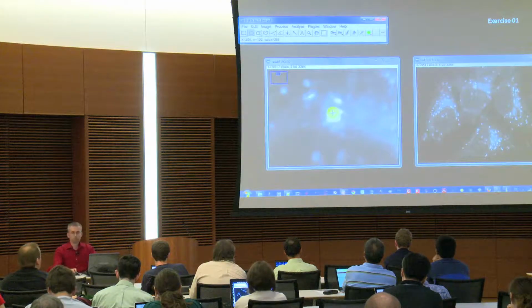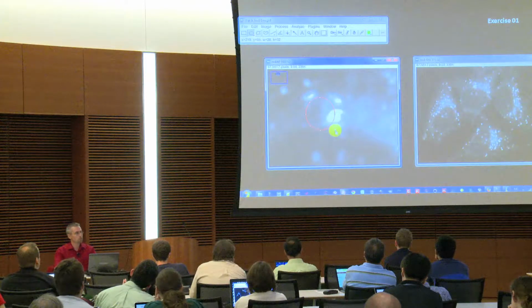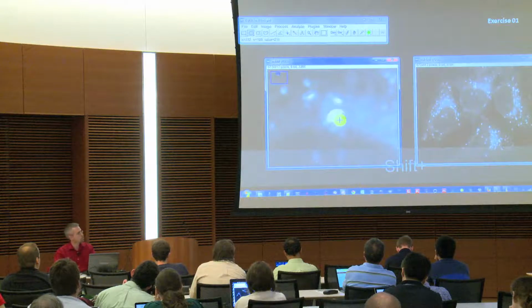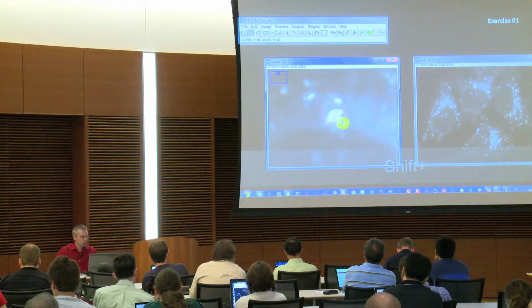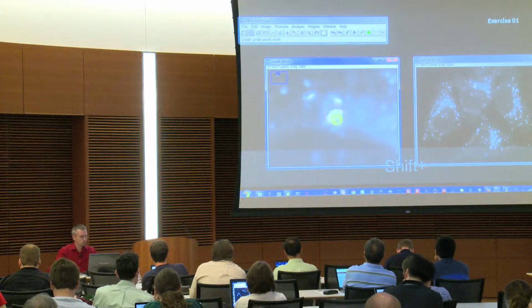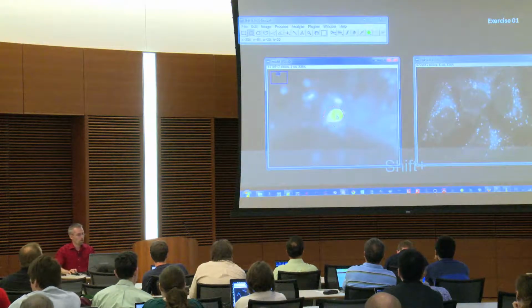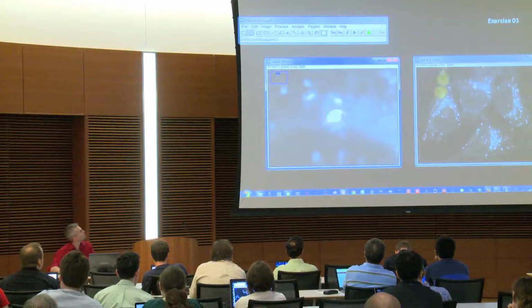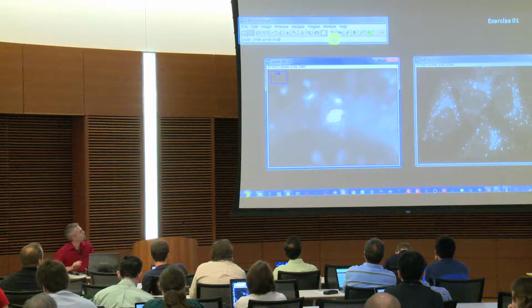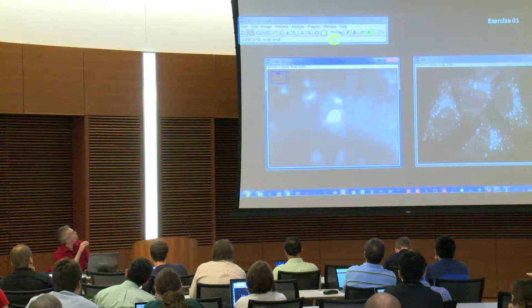You get a perfect circle if you press the shift key while you make the selection with the circular tool. Position the circle approximately so that this feature is inside, and then take out the mouse and move the selection with the arrow keys of your keyboard, up or down, no matter in which direction.